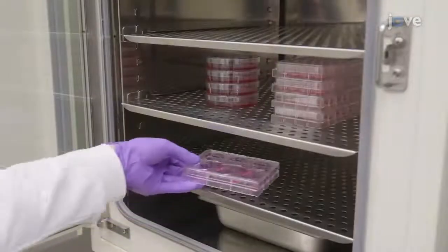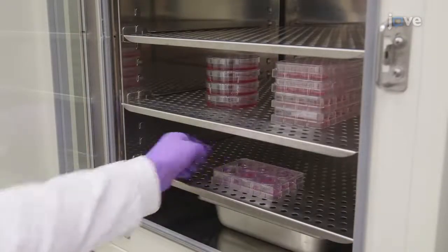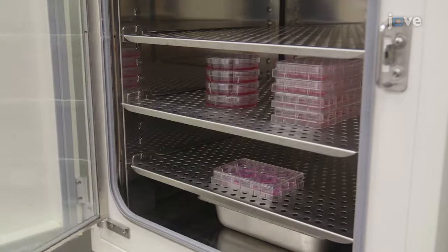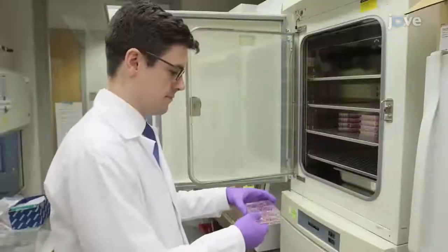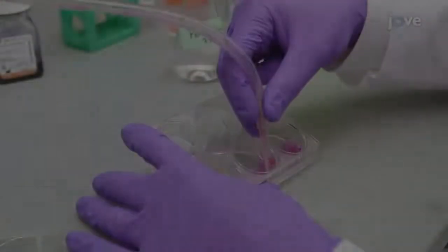Place the cells in an incubator at 37 degrees Celsius and 5% carbon dioxide overnight. The next day, from each well, aspirate the growth medium.